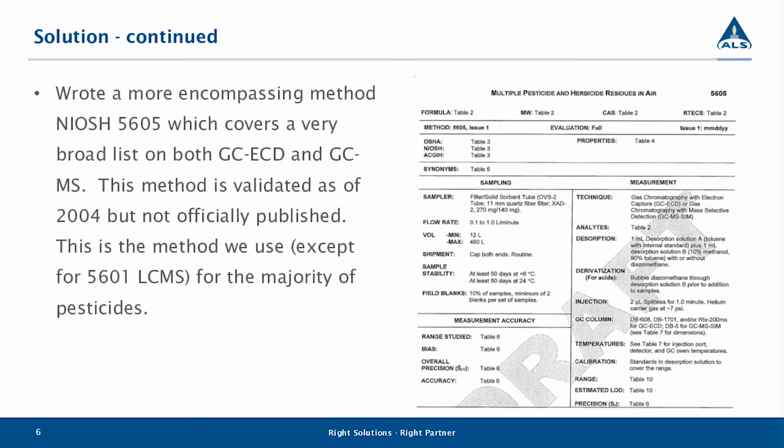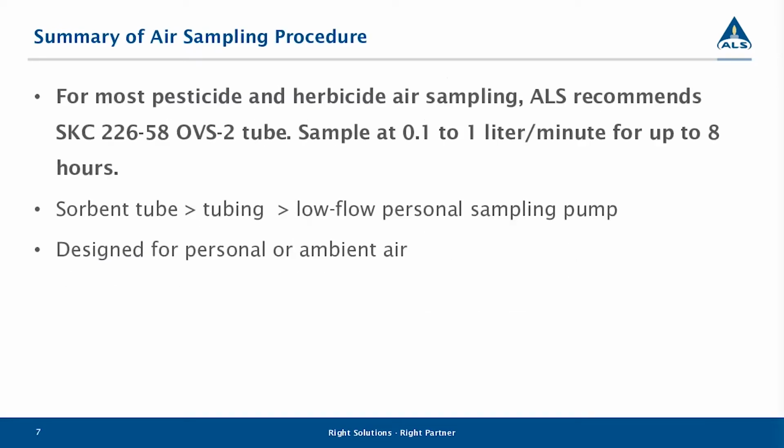With wipe methods, I actually don't have a slide specific to it. It was more straightforward because you're dealing with just surface particulates. It's things like a sterile cotton gauze, a glass vial, and usually isopropyl alcohol. Those have technically different method references, but the analytical work and the most difficult part of it was developing the air side of things.